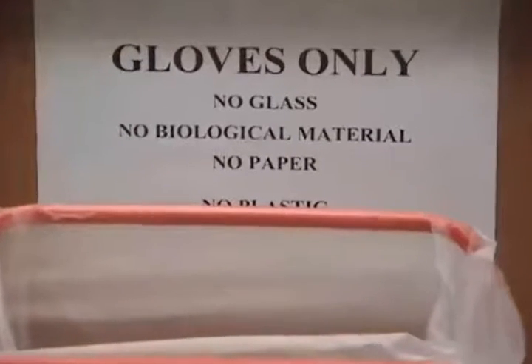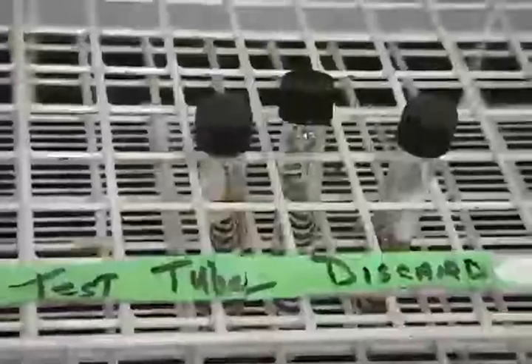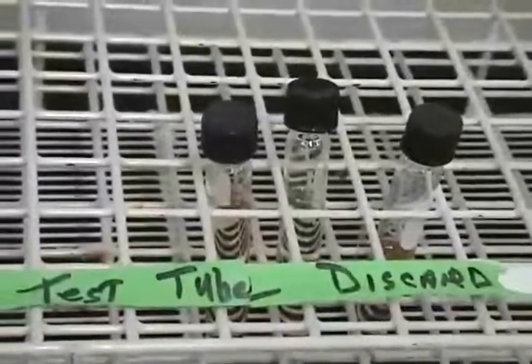There may be other special waste receptacles for your specific course. This is especially true for biotechnology, chemistry, and microbiology. For example, you may have Gloves trash, Petri plate trash, Test tube receptacle trash, Chemical waste trash, and other items. Your instructor will inform you after this video on how to dispose of those unique trash items.